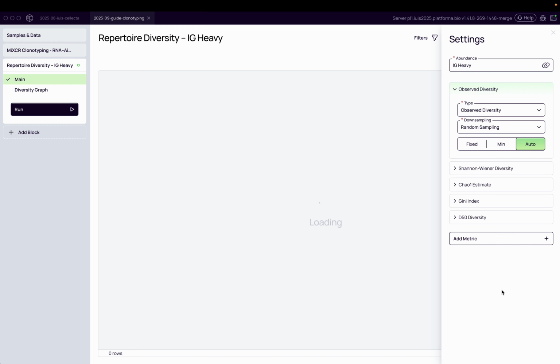So there is a bias, or we just have different sequencing depths. Let's say for one sample, we took 1 million reads in sequencing, and for another sample, which was sequenced a couple of weeks or months after with different sequencing technology, etc., we took several million reads into the sequencing. So proper downsampling or normalization is crucial for the statistical analysis of our data.